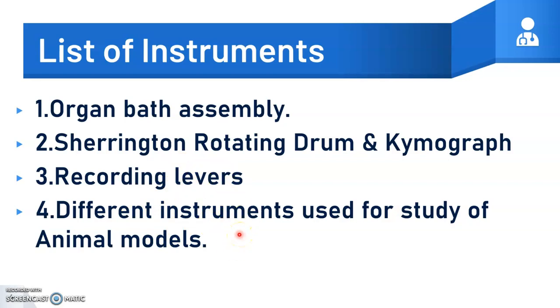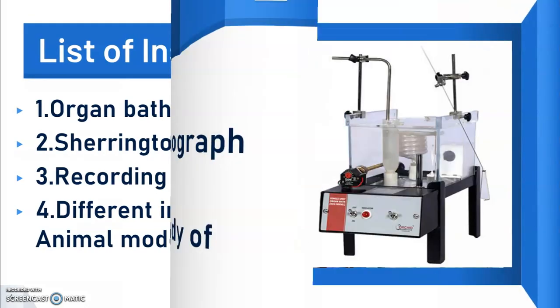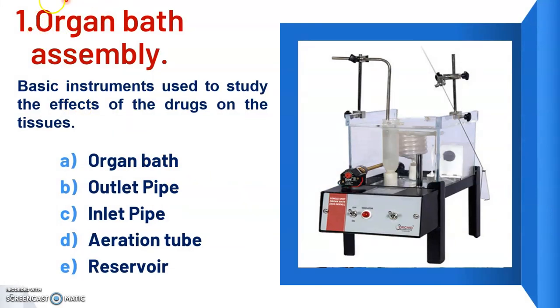Pause this video and write in your practical notebook. These are all very important for your viva as well as your synopsis and practical purposes. Now let us discuss one by one, and the first is the organ bath assembly.